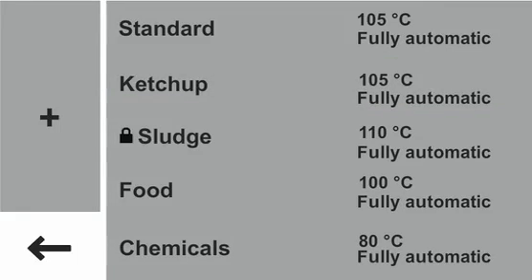A method that has not yet been released has a symbol in front of its name. This method is initially locked. You have completed the test run. You can run your moisture analysis now the same way.